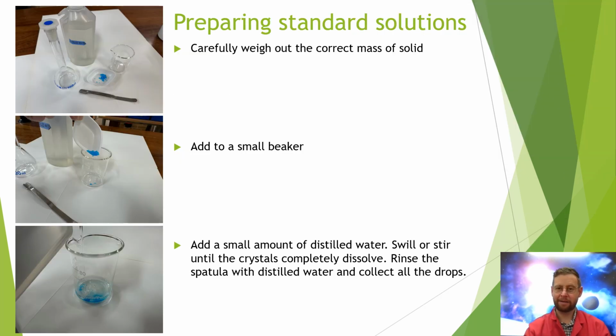So let's talk about making up that standard solution in the first place, that which we're going to put into our burette. Now, generally, we're going to make this from a soluble powder mixed with a liquid, but it has to be a very accurate concentration.